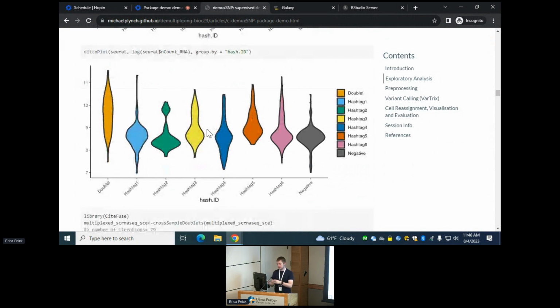For example, these are all sequenced together, so in theory they should all have the same sequencing depth. I know some models have actually scaled by that as well, and it does seem to improve performance. But I suspect there are other factors coming into play as well.